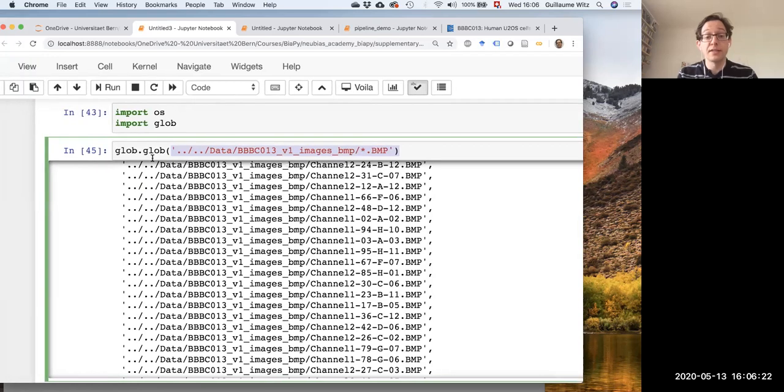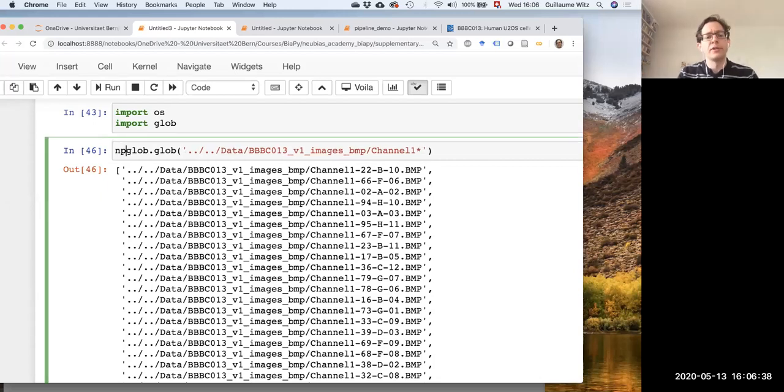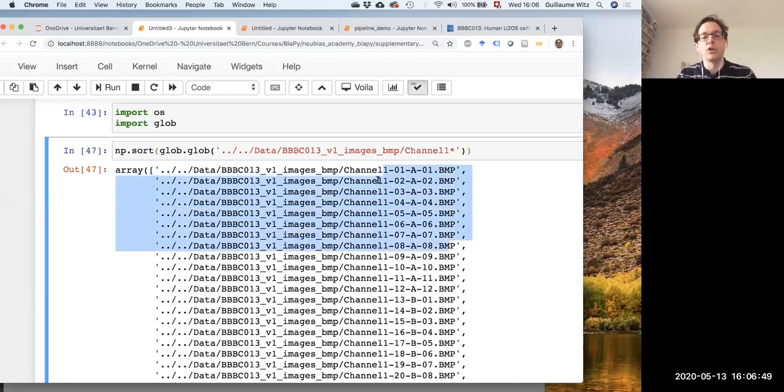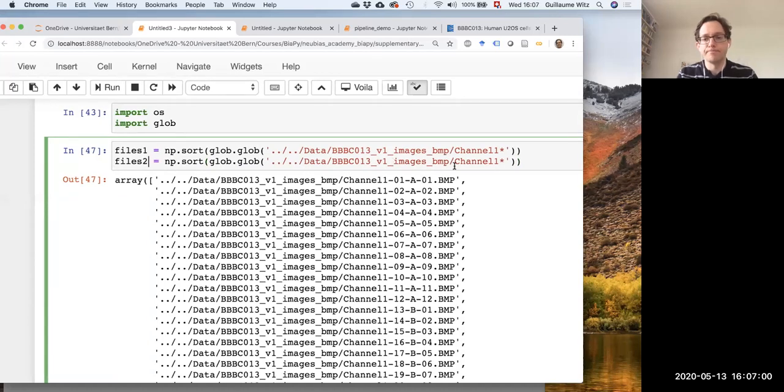Now I want two of these lists, one for channel one and one for channel two. So I can say channel one, and I will just skip this. Now I have a list of only the channel one. It's a huge list, and you see that it's not really ordered. To order it, I can use NumPy and say sort, for example. There are multiple ways of doing this. This works well. So now I have A, 1, 2, 3, 4, 5. This has been formatted and written in a nice way. It's not always the case, but this works fine. So this is my files one for channel one, and I will just copy this and do the same thing for files two.